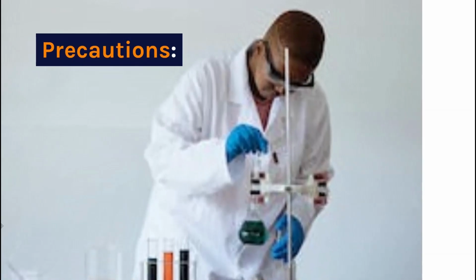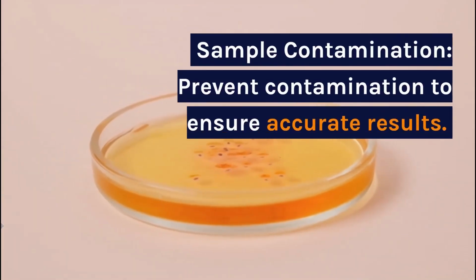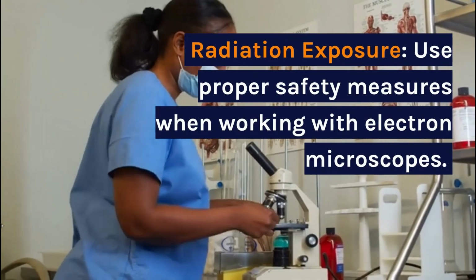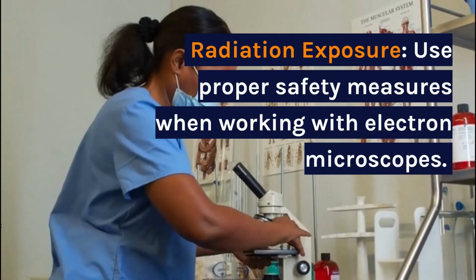Precautions. Sample contamination: prevent contamination to ensure accurate results. Radiation exposure: use proper safety measures when working with electron microscopes.